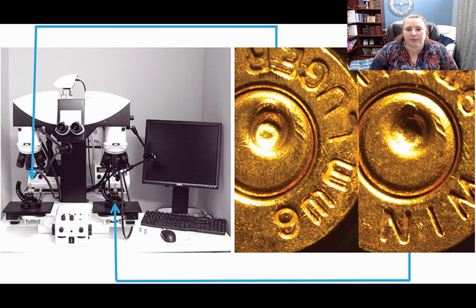The comparison microscope consists of two independent microscopes, each with its own staging plate and focus knob. These microscopes are linked by an optical bridge so that the image that's seen by the person using the microscope includes both independent images superimposed over one another.